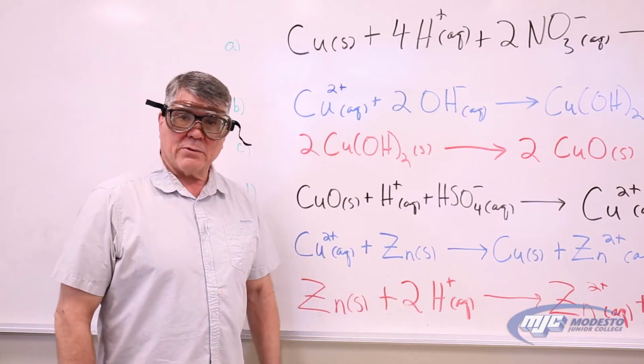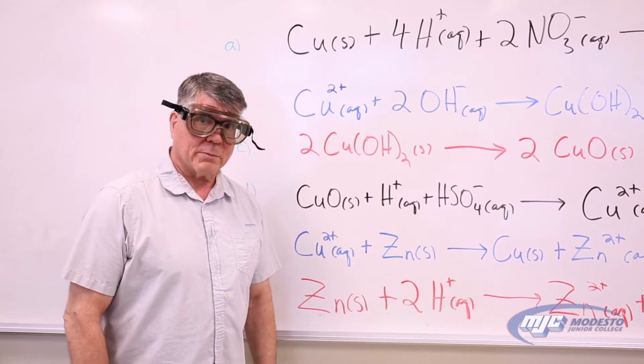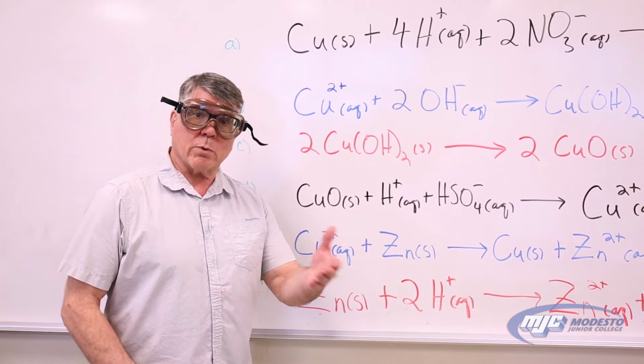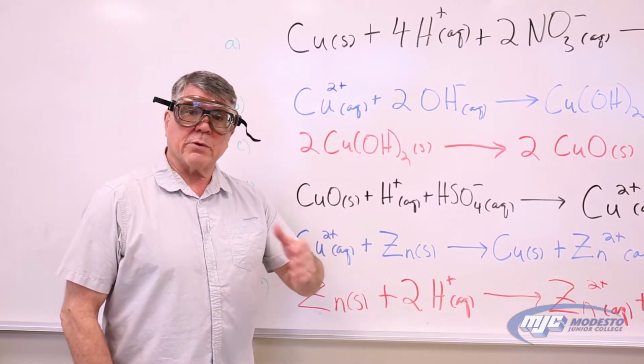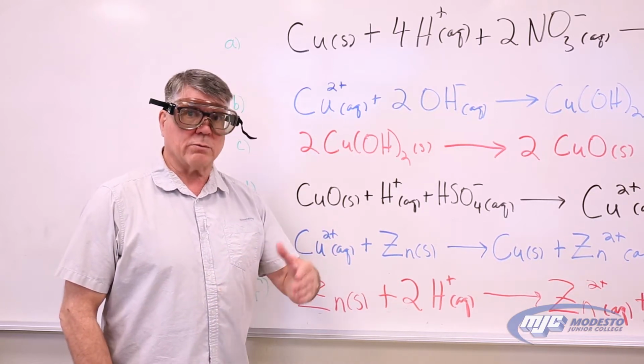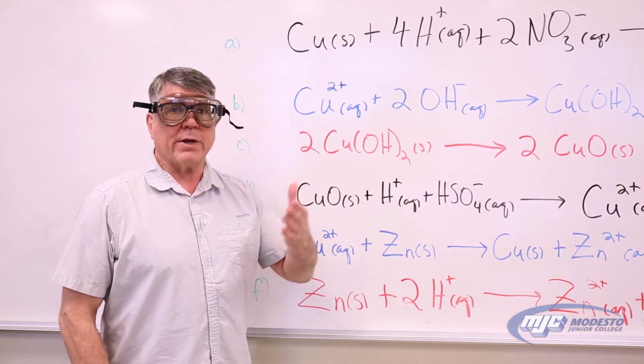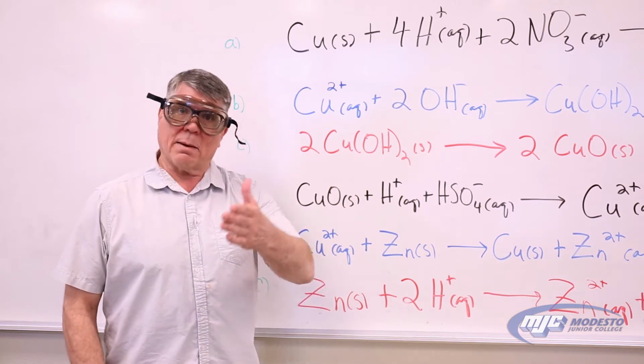Alright guys, I'm Dr. Cadell and this is the cycle of copper reactions. So in this experiment, you take some copper, weigh it out, and perform a series of chemical reactions on it. It'll transform each time and look quite a bit different. And at the very end, we're going to get that copper back out.